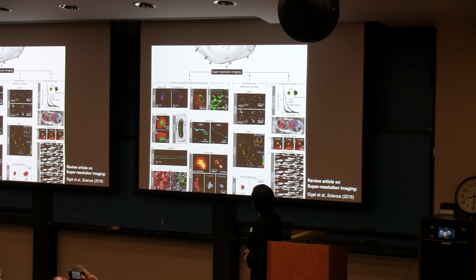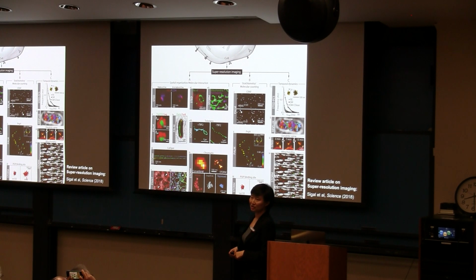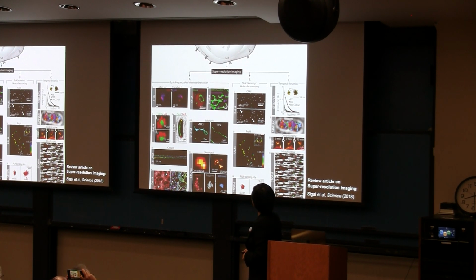Super-resolution imaging, both in terms of technology development and biological applications, has been done by many labs. And here is a recent review article that we actually wrote to cover some of the technological advances, but more focused on the wide range of biological applications.